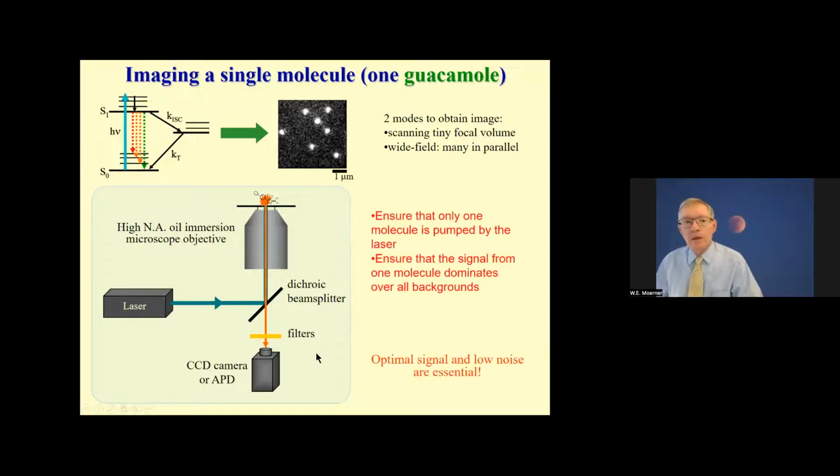This works if you ensure that only one molecule is pumped by the laser and that that molecule's emission dominates over all backgrounds. So signal being optimized or maximized and low noise are all essential.